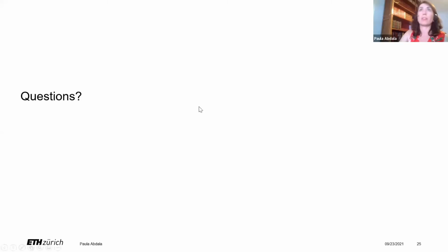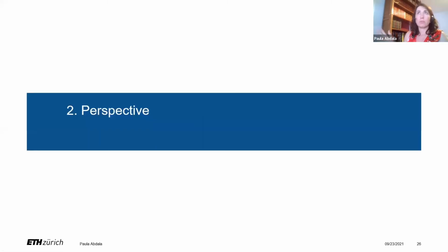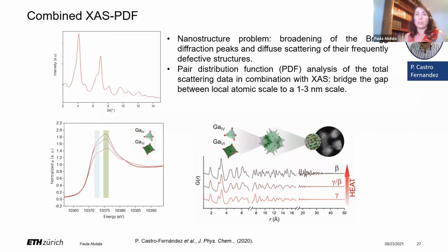Very good. So this leads me to the end of my talk, and here I would like to propose some perspective, also in terms of combined operando techniques. The data I have shown you have been mainly analyzed, the XRD data, in reciprocal space, right?